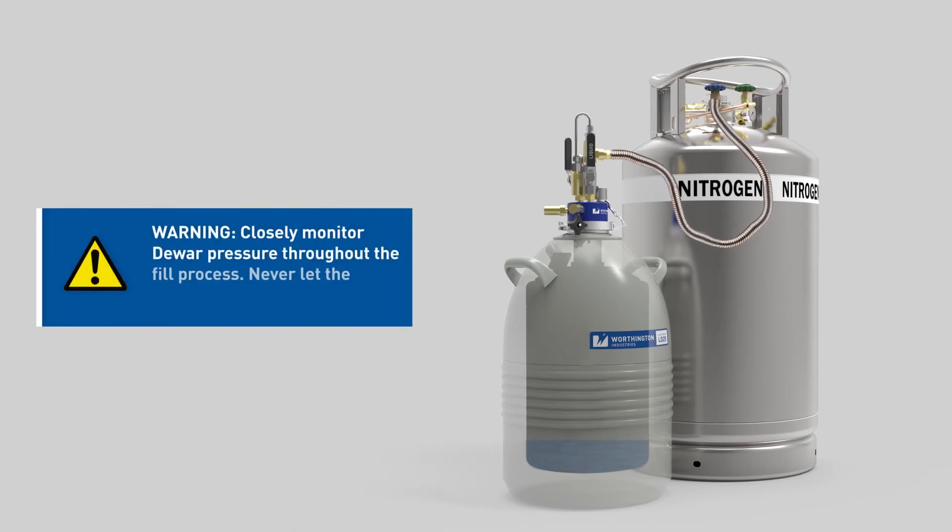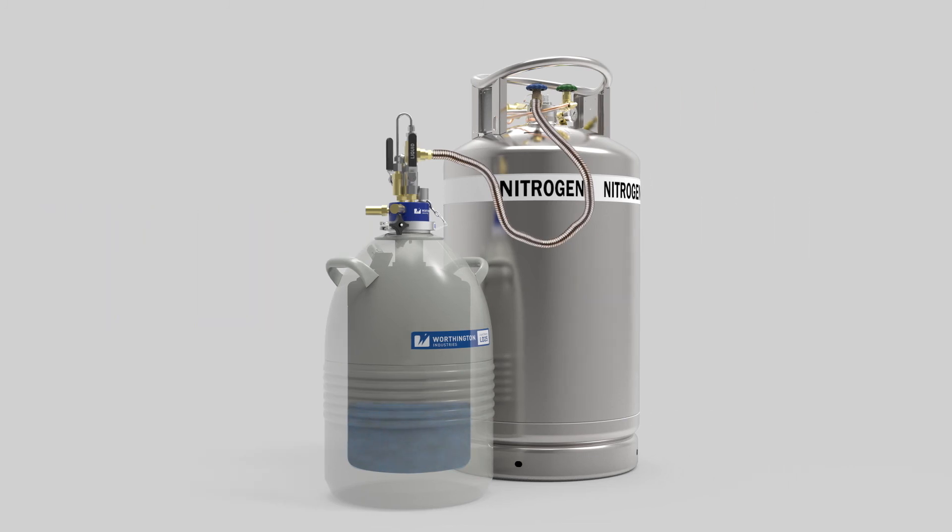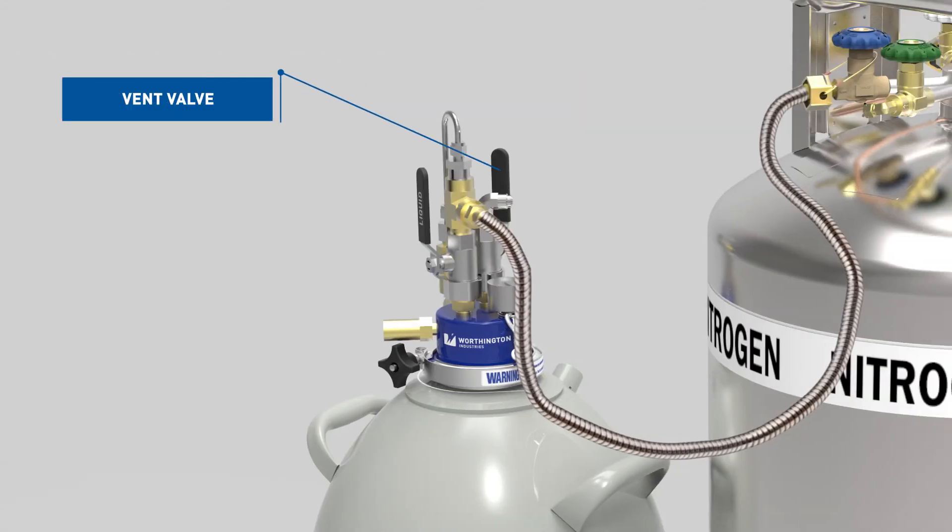Closely monitor Dewar pressure throughout the fill process. Never let the pressure exceed 7.25 PSIG. If the pressure approaches 7.25 PSIG, immediately fully open the liquid withdrawal device vent valve and/or close the liquid valve as necessary to control the pressure in the Dewar.